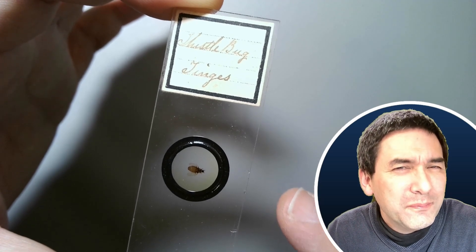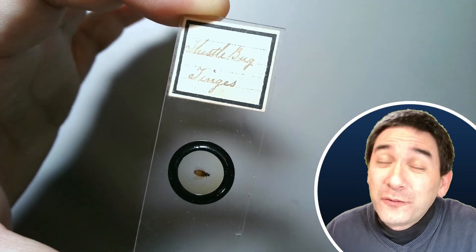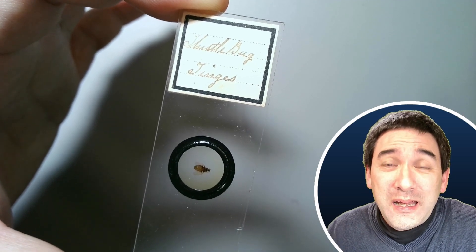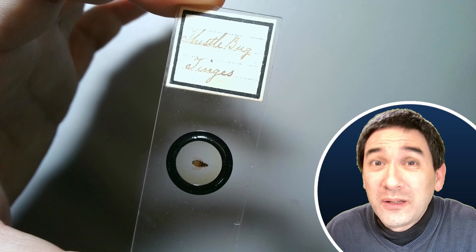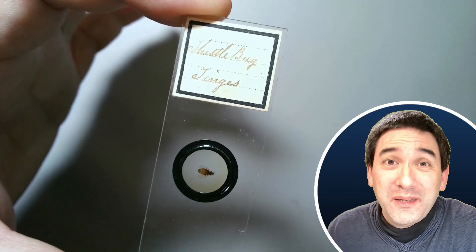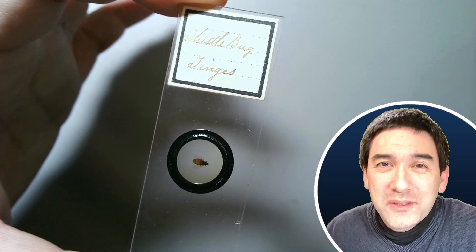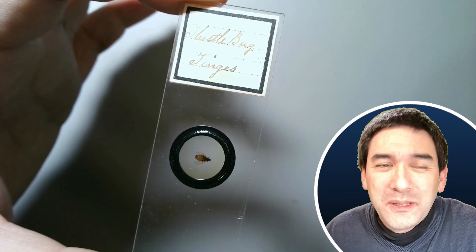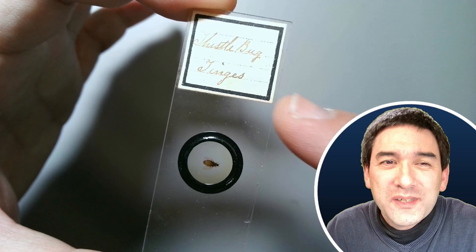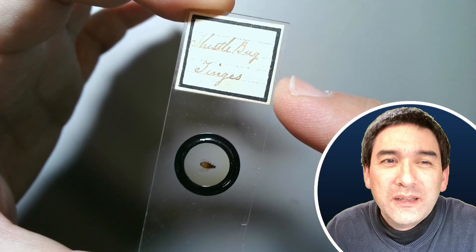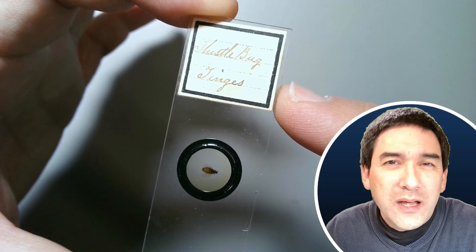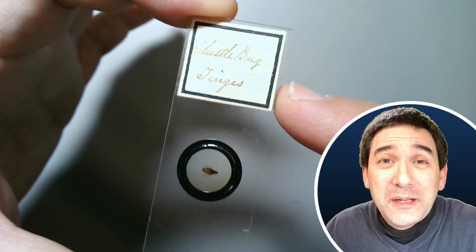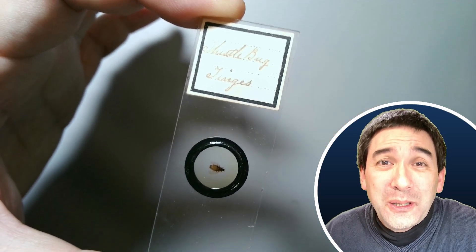Or really? What is that — a thistle bug? Unfortunately, I was not able to find any insect with that name. And when I looked at it, I could immediately see it is not a bug — and it's not a bug either, because bugs have a very typical structure of their wings, and this simply does not fit. And look at this here — what does this even mean? The second word here: 'Tinges'? I'm not even able to read this word properly, and I don't even know what this means.